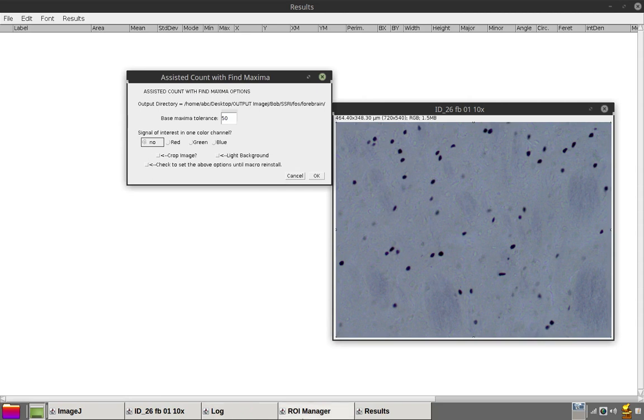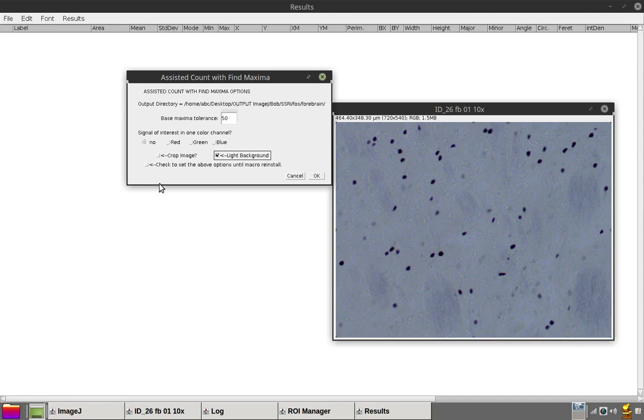Since this image contains dark points on a light background, check the light background box. And I won't save settings just yet.